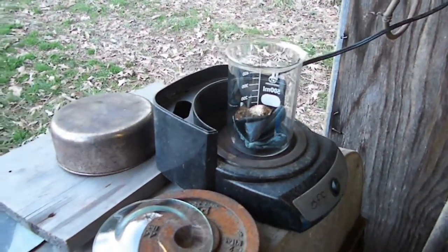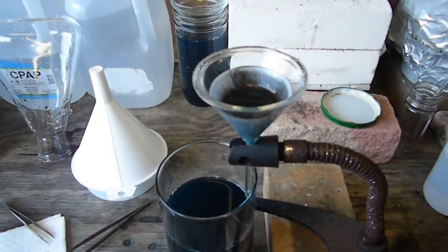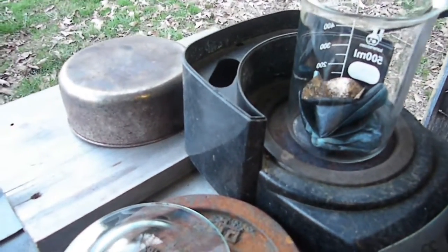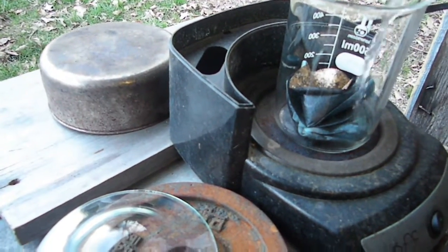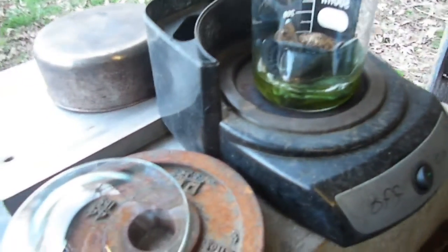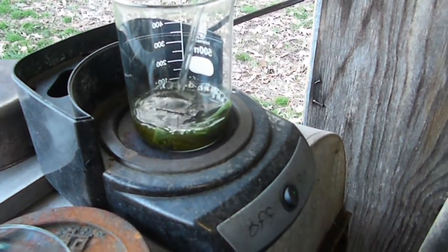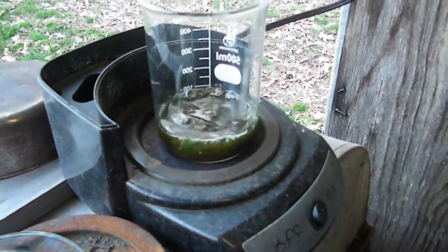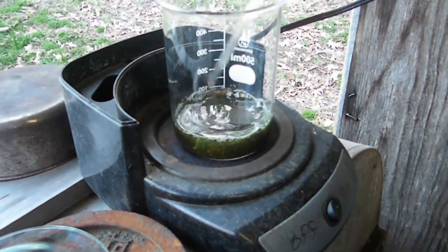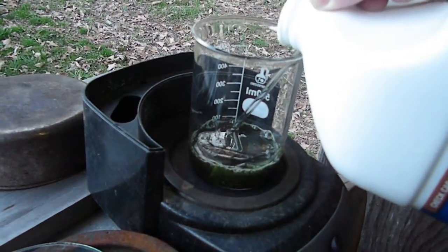Okay, guys, like I said, it is getting really cold out here. I'm waiting on this filter to finish. I'm just going to add it to it because I have got to get this going. So, like I said, we're probably going to get an instant reaction when we put some HCl in here because it wasn't neutral. So I'm just going to go ahead and put some of that in there. I've got the heat turned on a little bit. I'm just going to push this stuff down in here and we're just going to let it go. And we are getting a reaction. It is green because of the copper. But sometimes you just got to deal with stuff. I'm going to put a touch more HCl in there. We'll deal with the copper later.